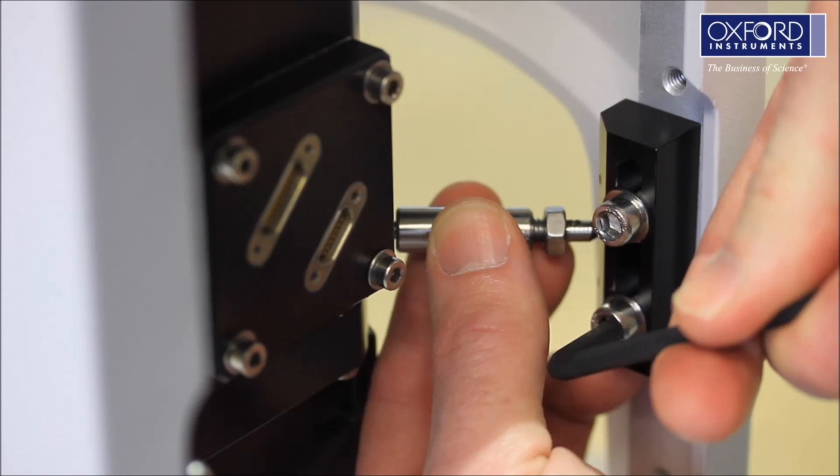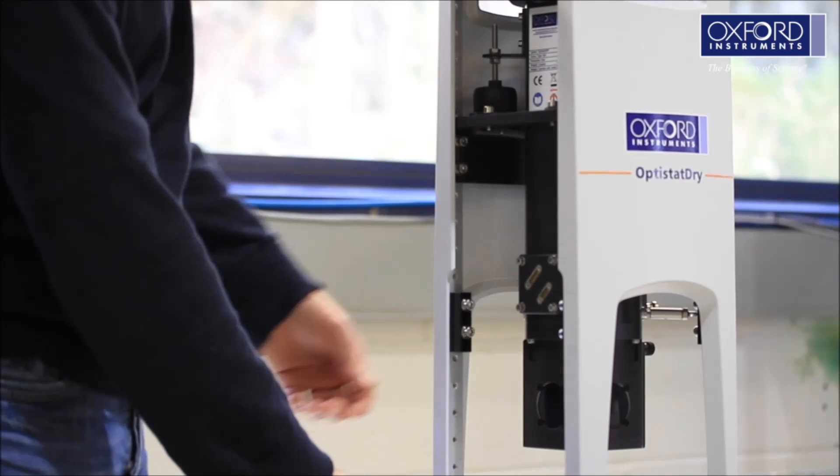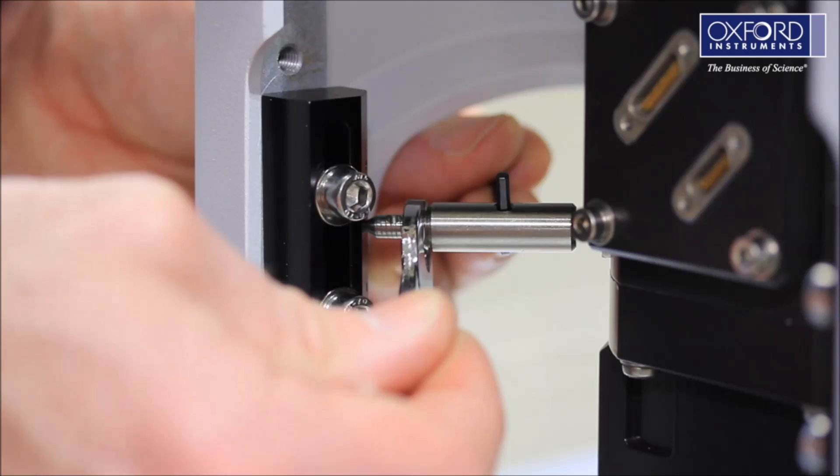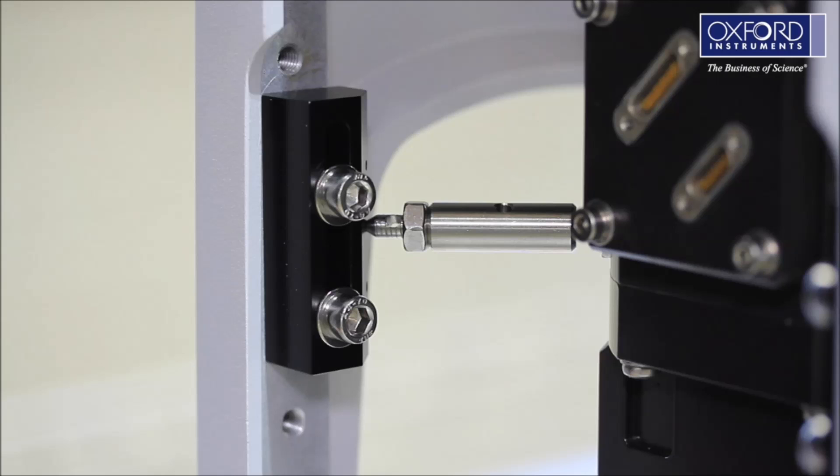Repeat this operation for all four radial restraints. When all four are in position, fix the final length of the radial restraints. Do not overextend them. The elastomer in each constraint should be only slightly compressed.